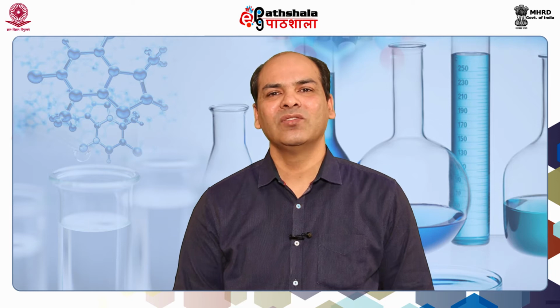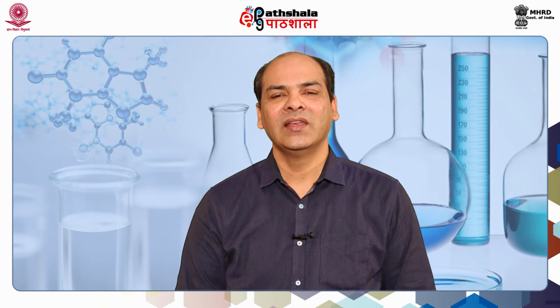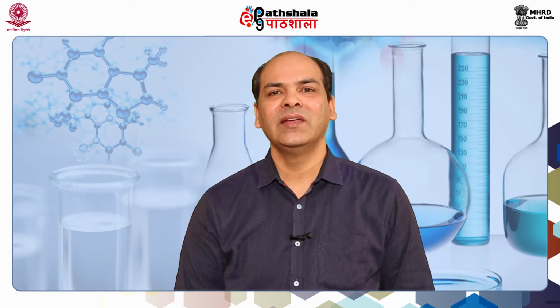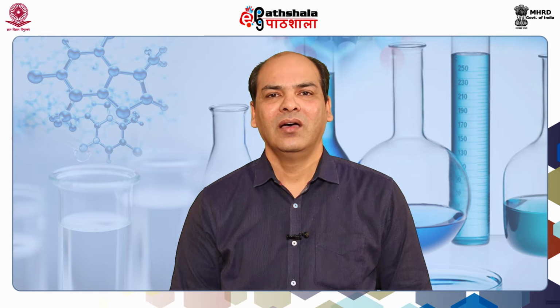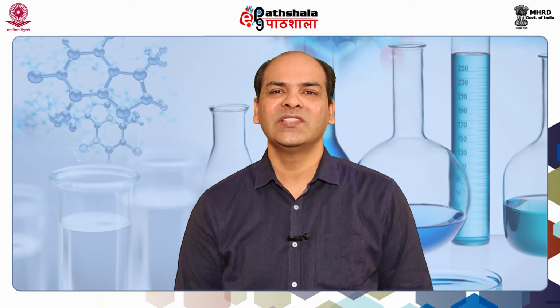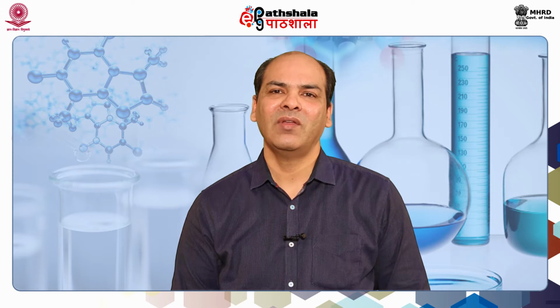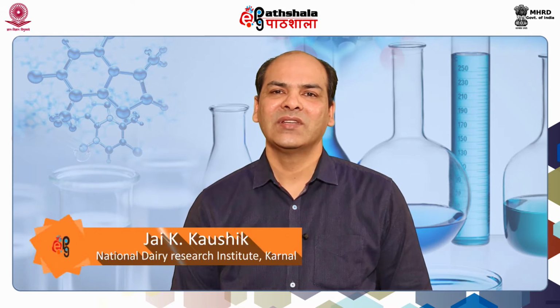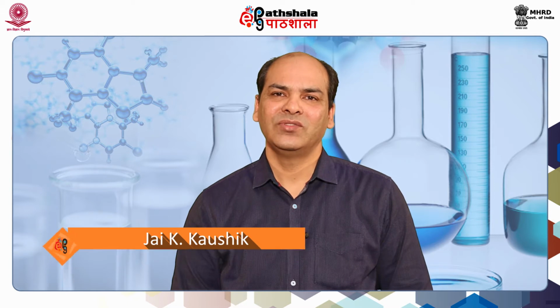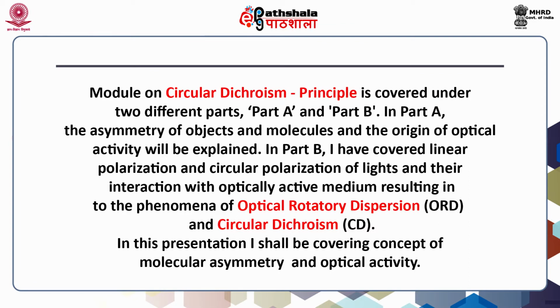In the case of small molecules, it is usually the structural part which we can investigate, while in macromolecules or bigger molecules, it is the conformational part which we analyze with circular dichroism or optical rotatory dispersion. These two techniques have the same origin at quantum mechanical level. So we will start with the two objectives that we will be talking about in the next slides. Thank you. The module on circular dichroism principle is covered under two different parts, part A and part B.